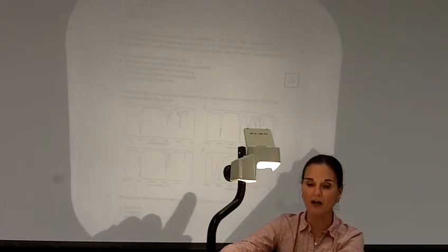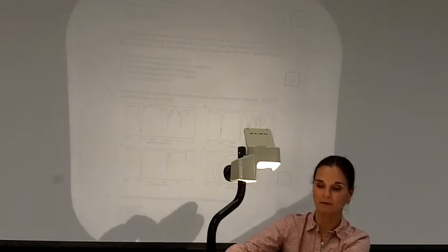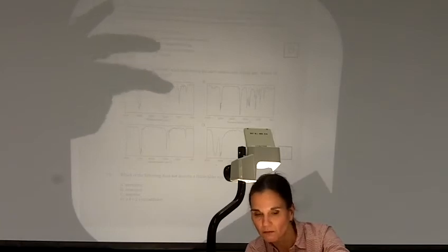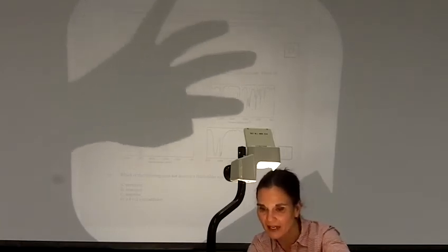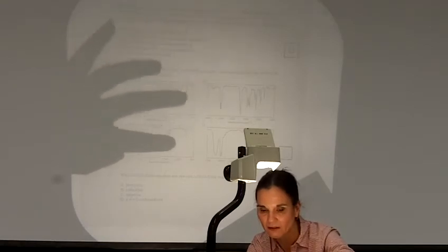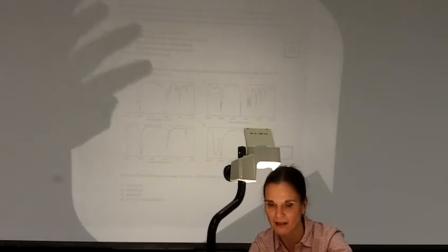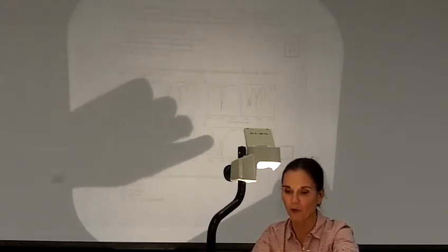So which IR shows an alcohol? D. So this one is probably, I think, alkene. This guy's carbonyl. This guy's potentially maybe alkene as well, okay? But this definitely has the broad OH stretch for D, okay?